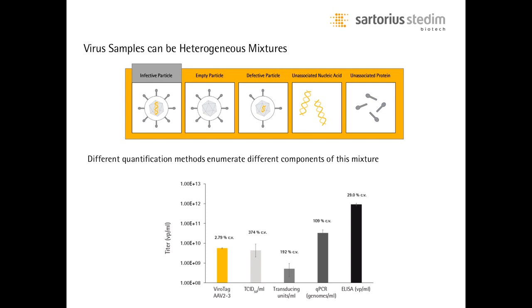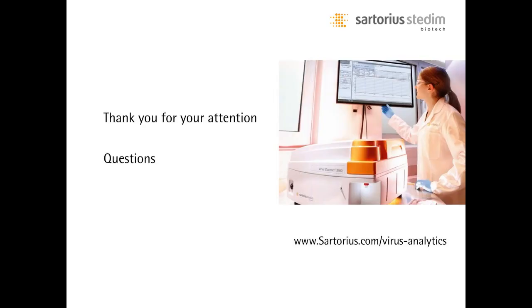Are there reagents available for different AAV serotypes? Yes, so there's different antibody-based reagents available, and AAV is one of them. If you're interested in our portfolio, please look at our website or write me a message and let me know what kind of viruses you're interested in. Okay. And can you use the instrument to quantify HPV particles? So human papillomaviruses, we cannot currently see. We are always increasing our portfolio, but HPV is something that is not currently possible.